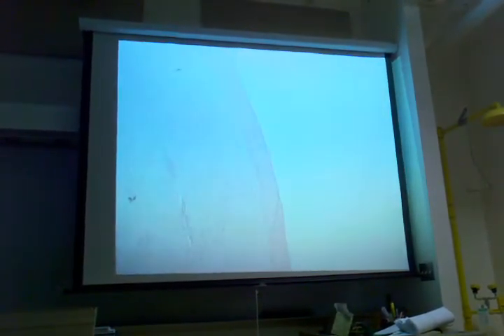And you're going to find it here in the ileum, just before you go back into the colon, okay? So now, let's look. Okay, so that's ileum with its 4 layers, right? Peyer's patches. These are lymphatic nodules. Muscularis? Submucosal. Remember, you always will look at submucosal to tell the difference between the sections of small intestine.